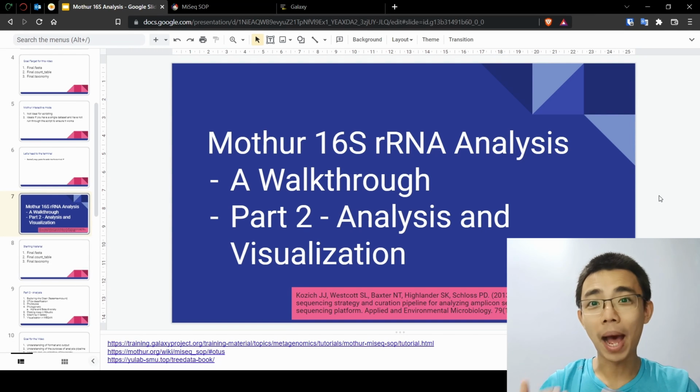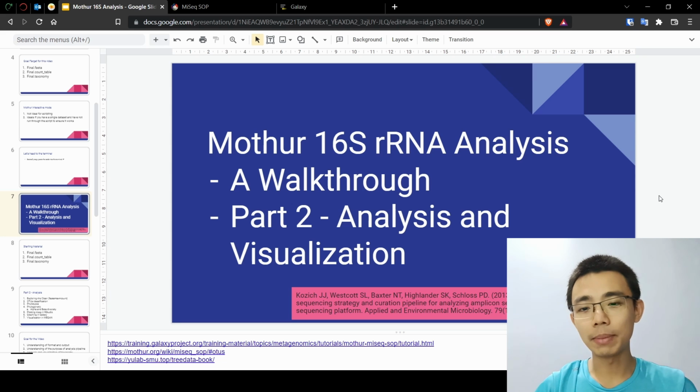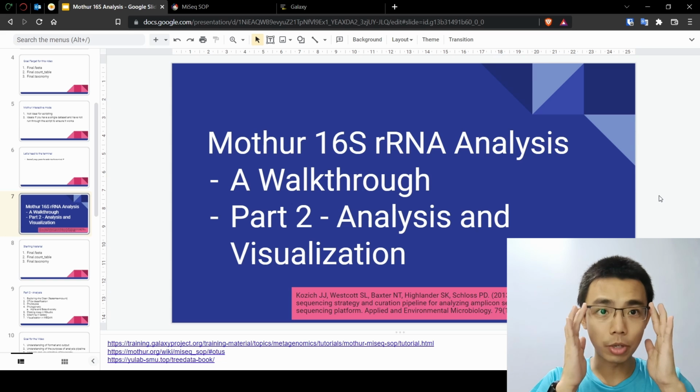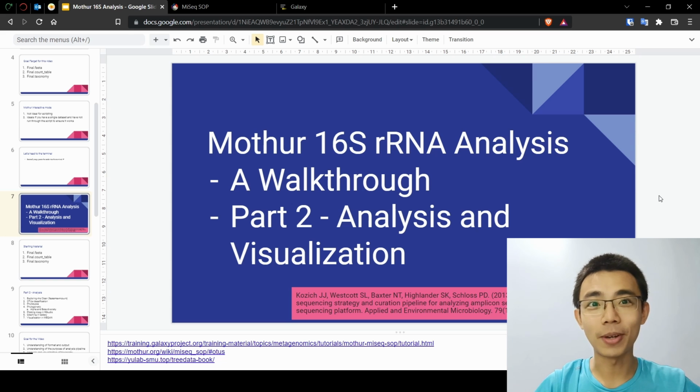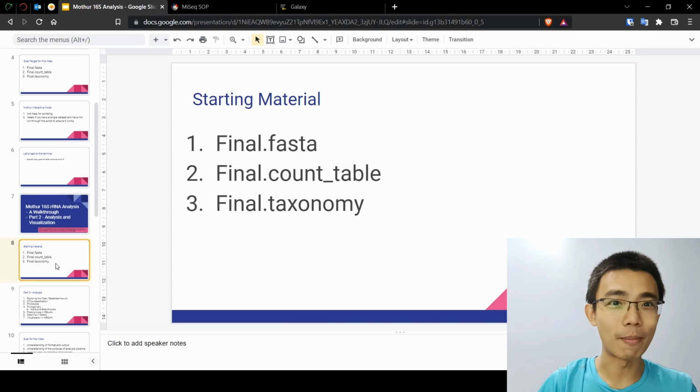So today is going to be part 2 of Mothur 16S rRNA analysis, particularly on taxonomy and how to actually do metagenomic analysis once you have done the sequencing. This is going to be a part 2 on analysis and visualization of the data. If you have not watched part 1, make sure you understand how to do data cleaning and preparation. Otherwise, you might want to finish that part before you come over.